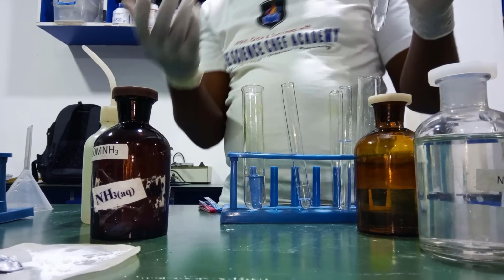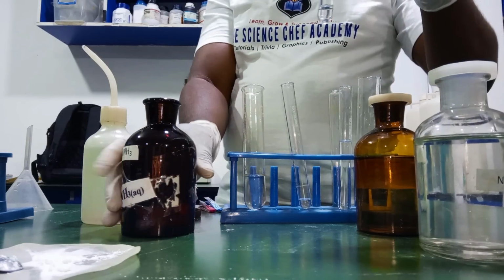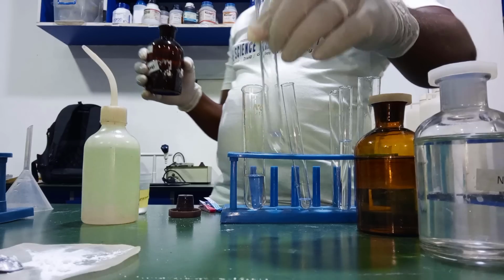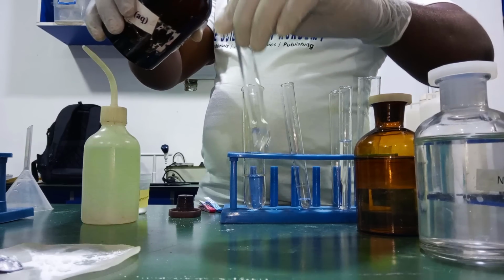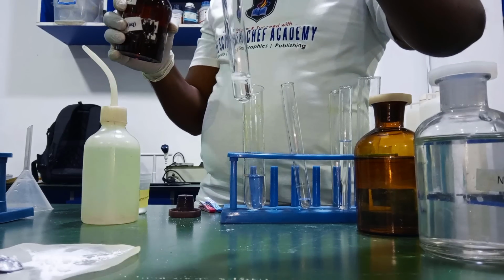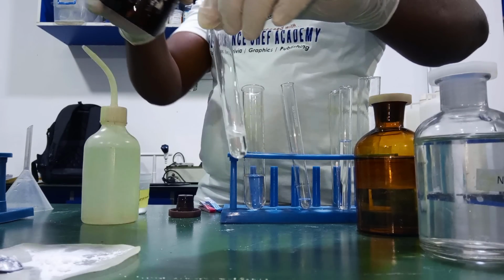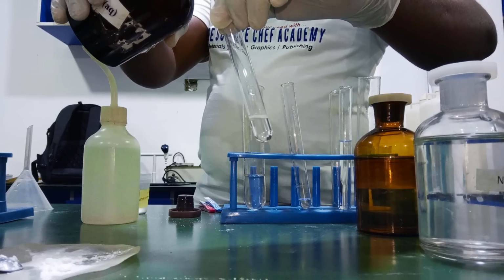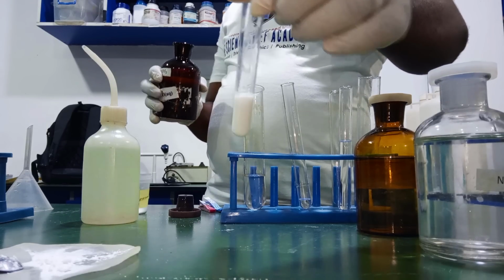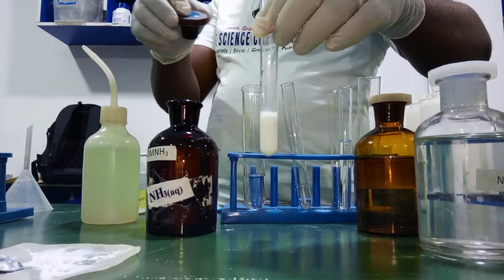We never can tell. So we are going to add aqueous ammonia. If you add aqueous ammonia to this, you expect to have a precipitate that will not dissolve in excess aqueous ammonia. So that is a white precipitate, right? Will it dissolve in excess? I don't know. Let's see. Can you see? The precipitate is insoluble in excess. So definitely it's not zinc.